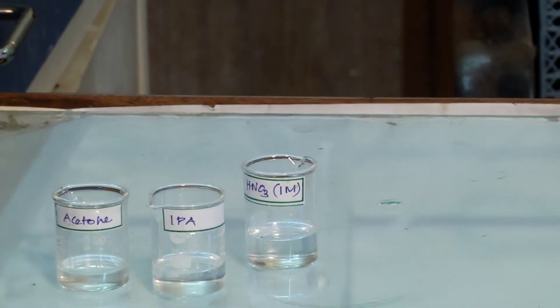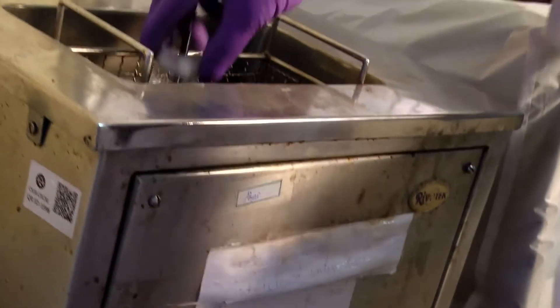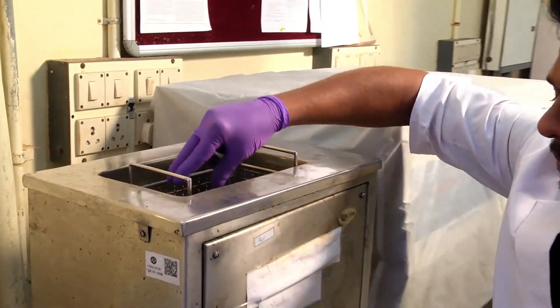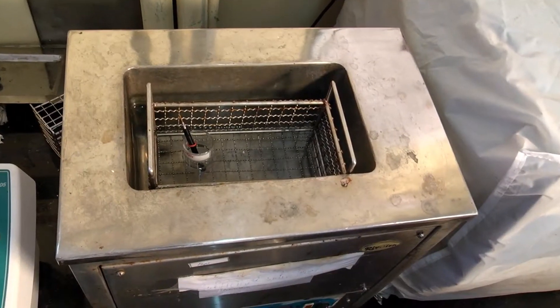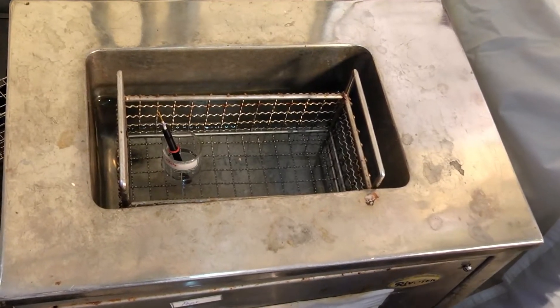After polishing, the alumina slurry was removed by ultrasonication either in isopropanol or ethanol and then in water for at least 3 minutes each.